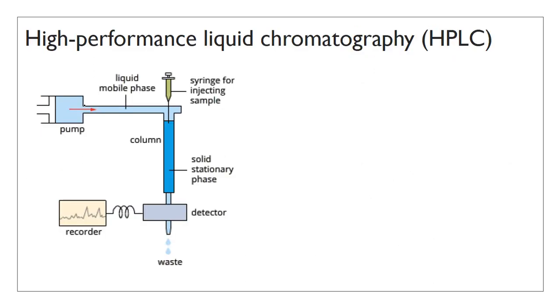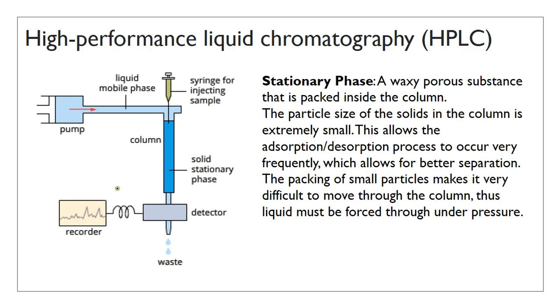All right, that's enough reminiscing about paper chromatography. The focus of this year is really on HPLC, or high performance liquid chromatography. Some also say high pressure liquid chromatography, which is fine. I mean, it does have a pump. So this is what it may look like.